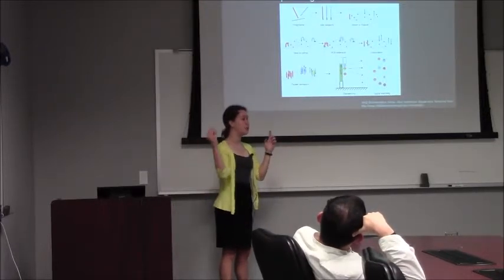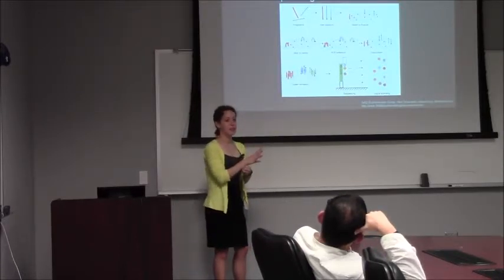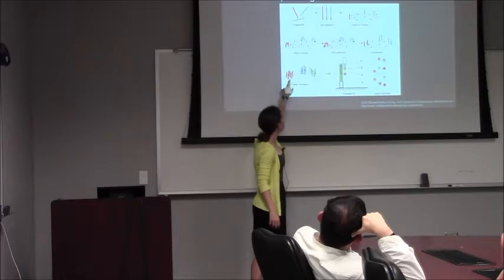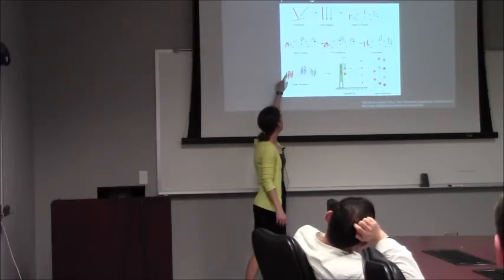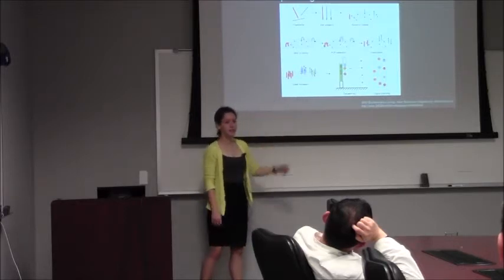So as the T binds to, say, one of these, it lets out a little fluorescent signal, a little piece of light. And this machine can look at all of the light being emitted from not just one cluster, but all the clusters at the same time, and keep track of, well, this blue light is coming from here and that's the first one I saw, so therefore the first one is an A.